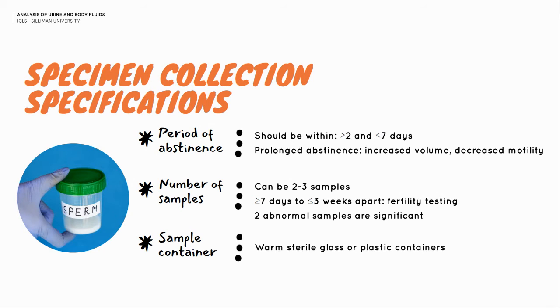I can still remember when we did this, one of the considerations is that after the sample is collected, it should be kept at body temperature, so usually it is placed under the armpit. After ejaculation, the body temperature should still be maintained for the sample.